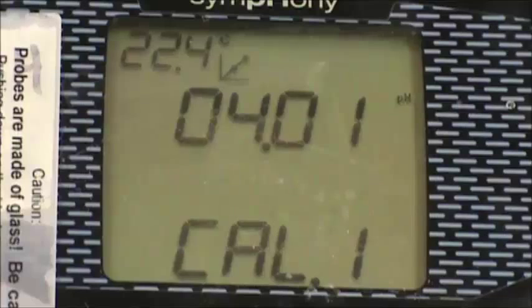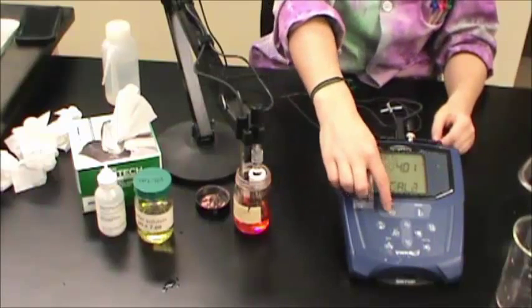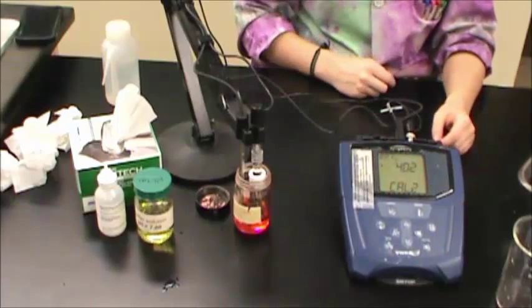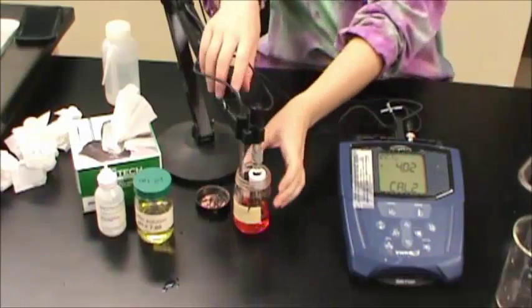The pH reading has stabilized when the pH icon on the right side of the screen has stopped flashing. The correct value for the buffer solution you are using should be shown. Press CAL again to save the value for your first calibration and to add a second.